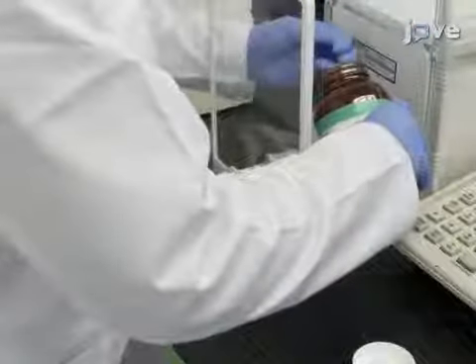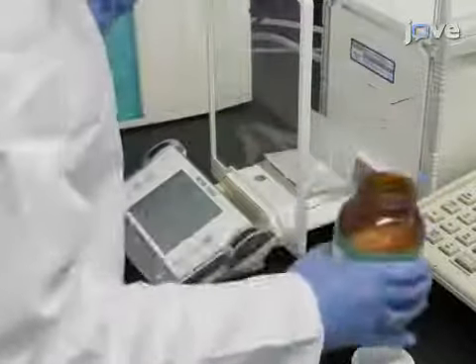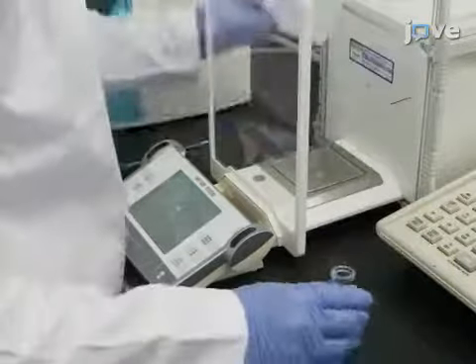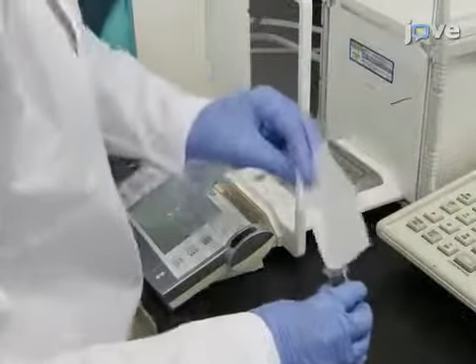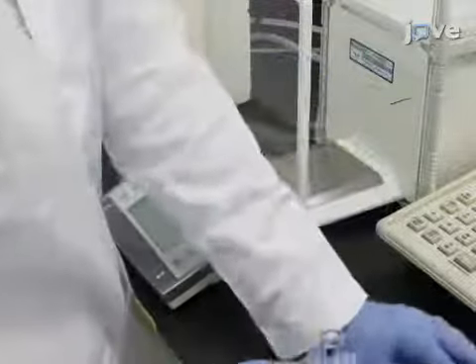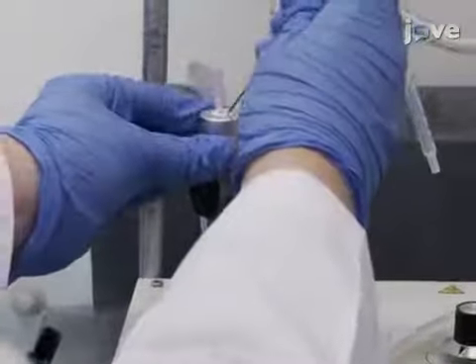To begin the radiolabeling procedure, in a microwave vial, combine 8 mg of potassium boranocarbonate, 15 mg of sodium carbonate, 20 mg of sodium tetraborate decahydrate, and 25 mg of potassium-sodium tartrate tetrahydrate. Purge the vial with argon gas for 10 minutes.